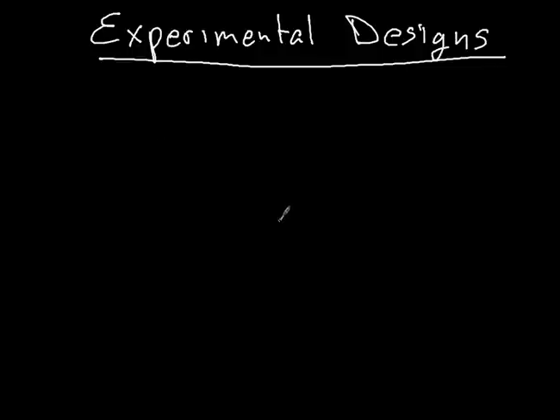Okay, guys, so experimental designs for determining enthalpy. I'm going to show you two setups for two different kinds of enthalpy calculations, and we'll be doing both of these laboratories in class. I wanted to give you a heads up for them. It is important that you know how to illustrate them because it's likely to be a question that you're going to be asked. So let's examine the first experiment.